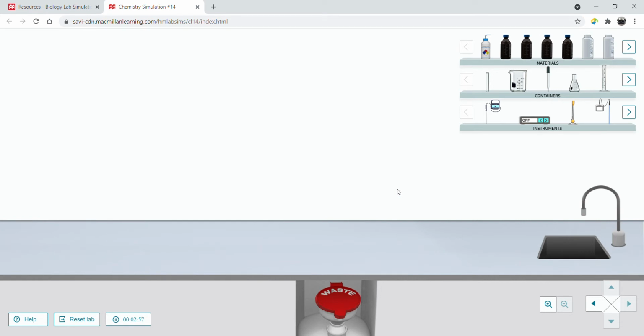As you know, you should have read up on enzymes before starting the lab, because I'm not going to go through this in great detail. As you are aware, enzymes are proteins, biological catalysts. They're molecules that promote biochemical reactions. They allow them to occur at all, or occur more quickly.